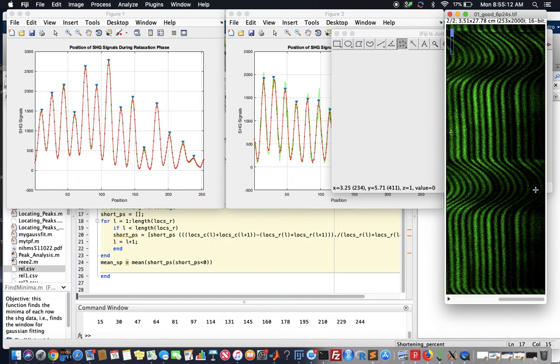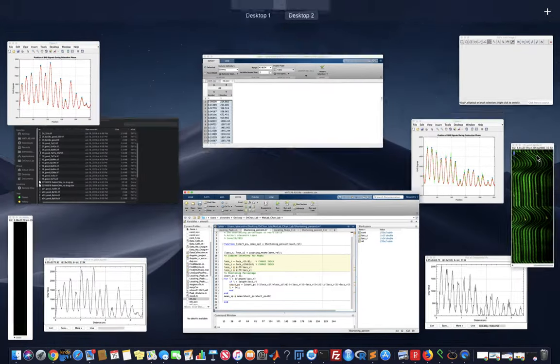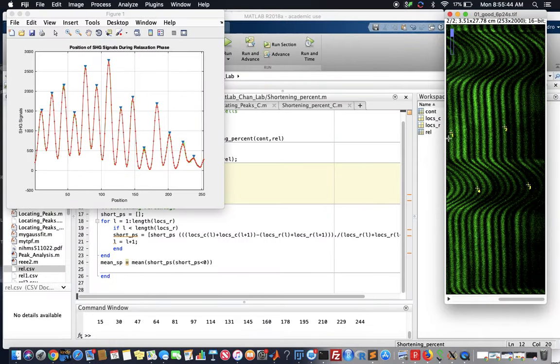First band, we're just going to cut a short go here. So we're going to use these bands here. Indexed in the code, we're going to want to include 1, 2, 3, 4, 5, 6, 7, 8, 9. So we're going to put 1 through 9. Now this is going to vary for every code. You're going to want to make sure that these parabolas here match up with these bands here, and you do so by checking if the marker is marking the correct band.